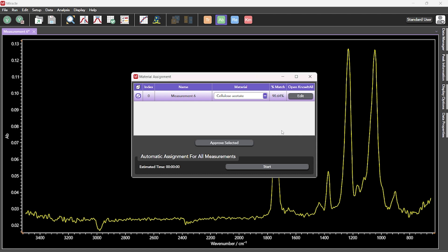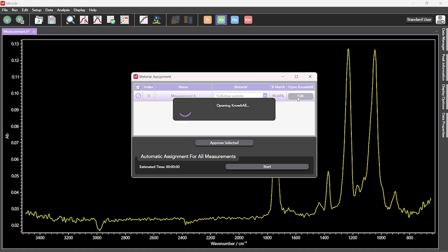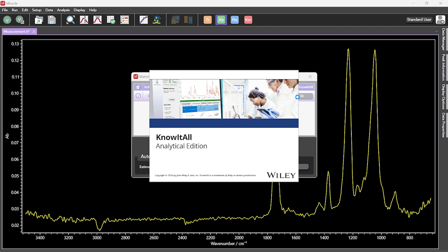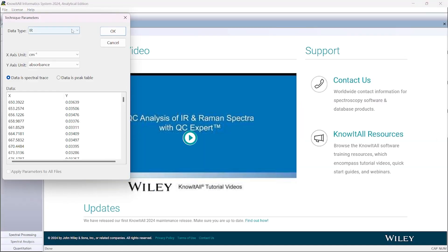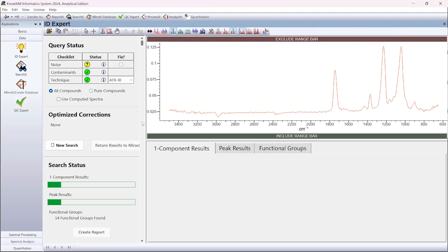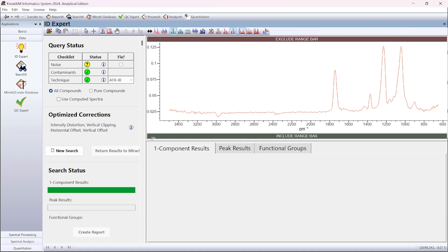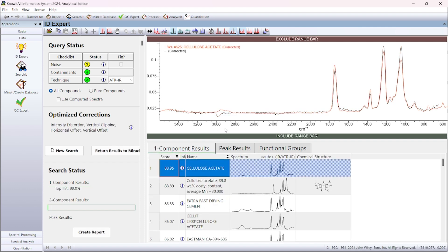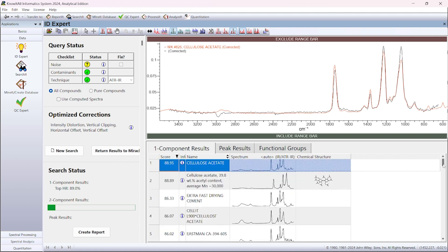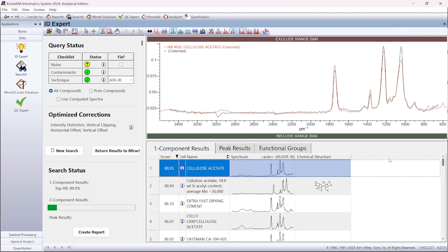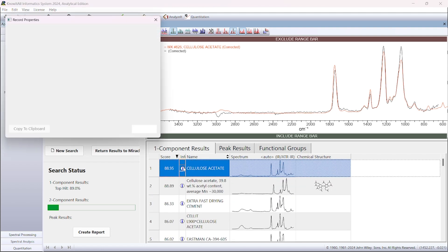Once a sample has been identified, the approve selected button is pressed. KnowItAll can be opened directly from this window by pressing the edit button. Within KnowItAll, both the taken spectra and the spectra within the database are overlaid so the similarities can easily be seen. The 50 closest matches to the obtained spectrum can be seen below, along with information on each individual material by pressing the information button.